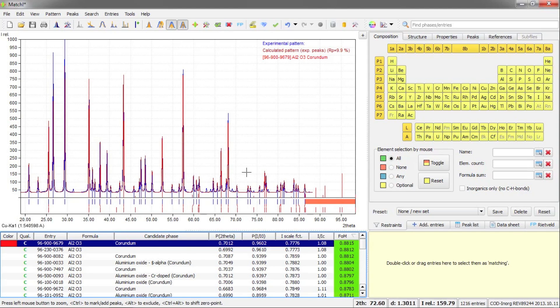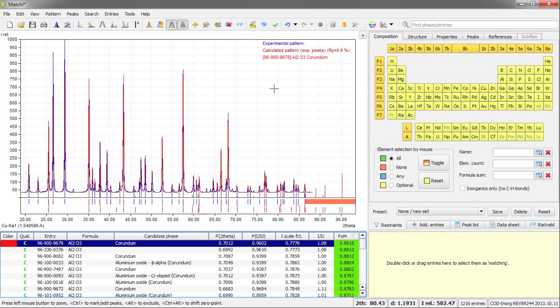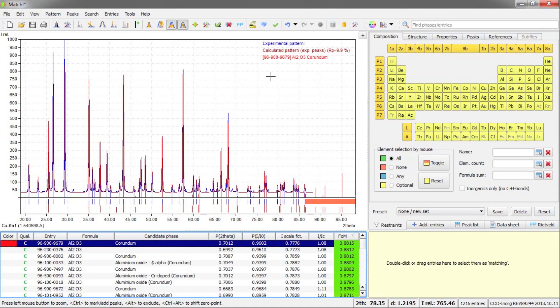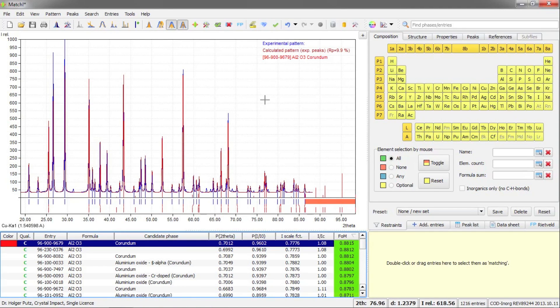On the upper left hand side, this is the most important window, you see the diffraction data, both experimental pattern in blue, as well as the calculated pattern from the experimental peaks in dark red. And in red, the peaks of the phase that is currently marked here in the candidate list below.